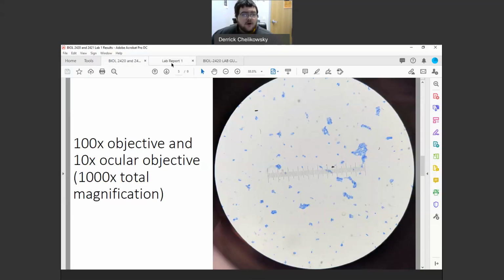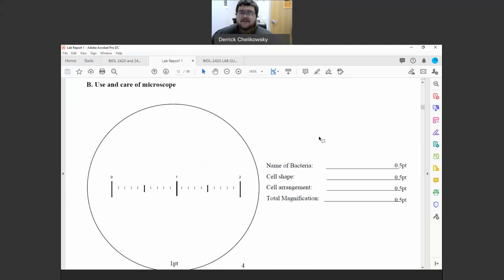type of drawing are you doing? Drawings in this case are not to be done digitally. We cannot prove that you didn't cheat. It's very easy to draw something on with an eye pencil here and then copy, paste it, and send it to everyone else. So it does have to be hand drawn.